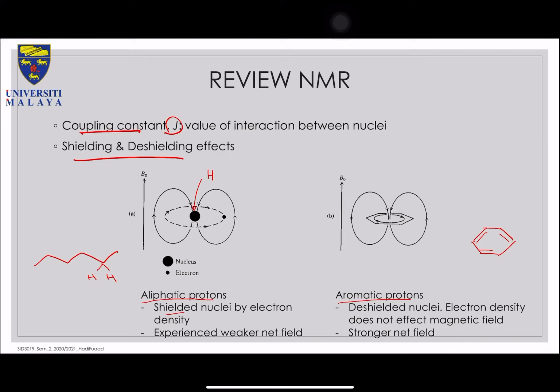As the electron density goes around the protons, again, don't imagine it as a single electron moving in a straight pathway. You need to remember that the position of an electron, at least based on our current technology, is very difficult to determine. So we normally use Huckel theory, whereby you look at the probability of electron position, which is also known as the electron cloud. So imagine that you have a big cloud like that. Therefore the nuclei with respect to the magnetic field of the NMR are shielded, because you have a very dense electron cloud on the left and right hand side of the aliphatic protons.